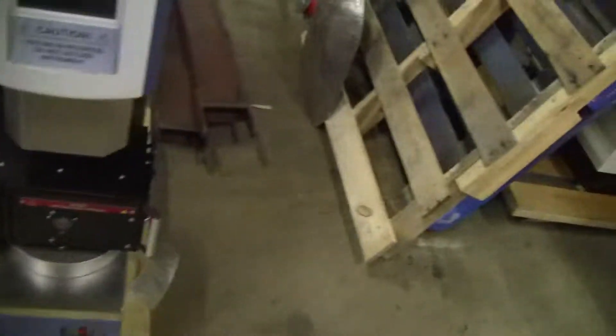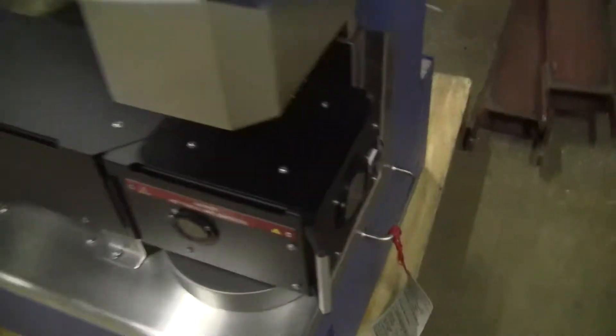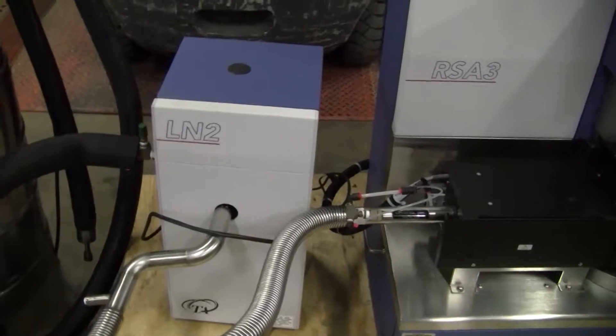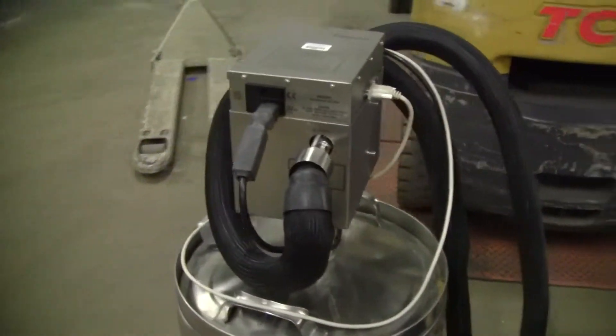You can look at it. I don't have any experience with this, so there's not much I can tell you. I'll just show you the machine. It comes with an LN2 liquid nitrogen accessory plus a liquid nitrogen doer.